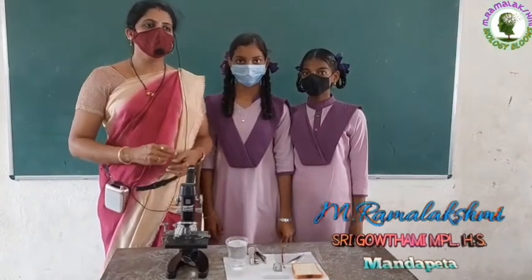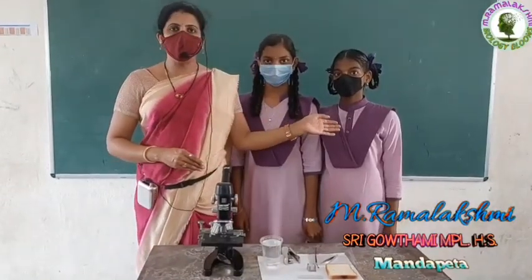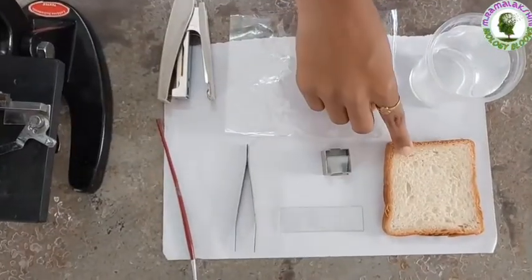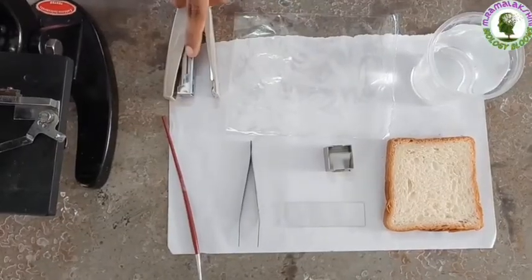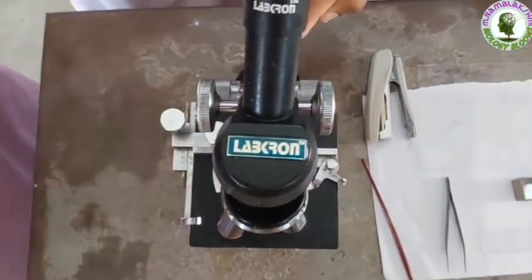Children, today we will plan to observe the bread mold under the microscope. Your friends Nohita and Harika will do this. To observe bread mold or rhizopus, we need bread, water, polythene cover, stapler, brush, forceps, slide, cover slip and microscope.